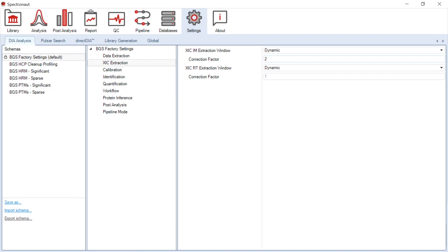I would like to underline here that alternatively, you can perform a direct DIA analysis of your ion mobility DIA runs, which means no library has to be generated.